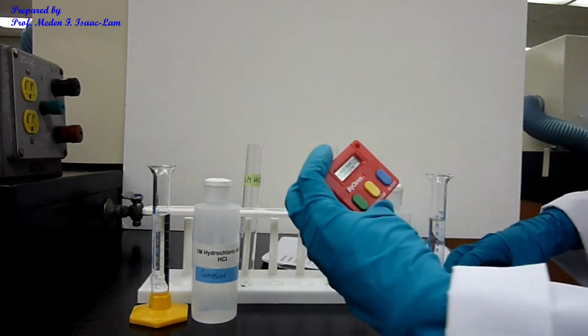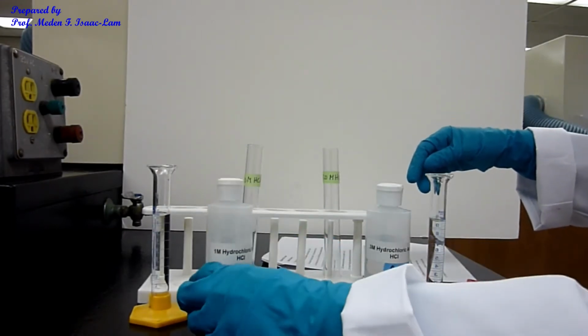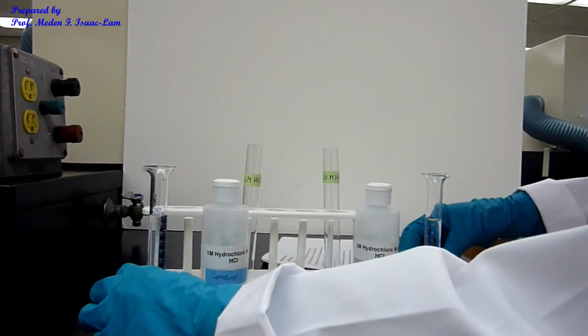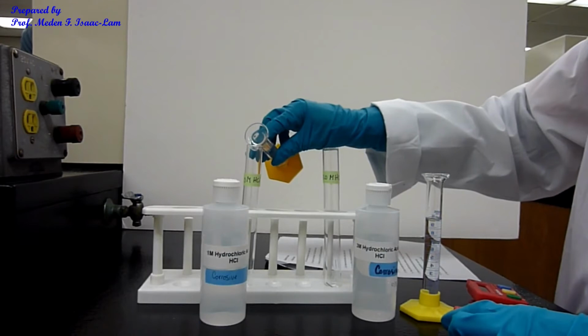So again, I have a timer, and this is 1 molar hydrochloric acid, lower concentration, and the other one, 3 molar hydrochloric acid, higher concentration. I already measured 10 mL in a graduated cylinder. So when I put it, I'm going to set the timer, and then we observe.